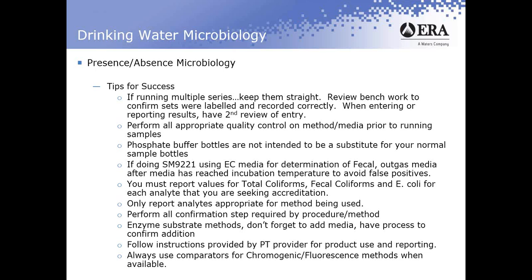Another tip for success: perform all appropriate quality control on the method and the media prior to running the samples. Now, as many of you are aware, there are a number of CRMs that are available for microbiology, not only from ERA, but from a variety of companies. They come at various quantitative levels. They're appropriate for a whole host of methods.